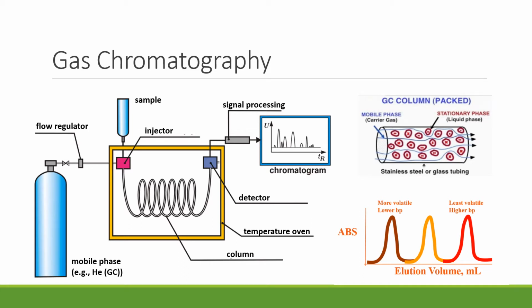The way this works is at first we take a tiny sample of our mixture of substances that we want to study and place them in a syringe and inject them into the machine. Then the components of the mixture are heated and instantly vaporized. Next, we add that carrier, or the eluent, which is simply some type of neutral gas, such as hydrogen or helium, designed to help the gases in our sample move through the column.